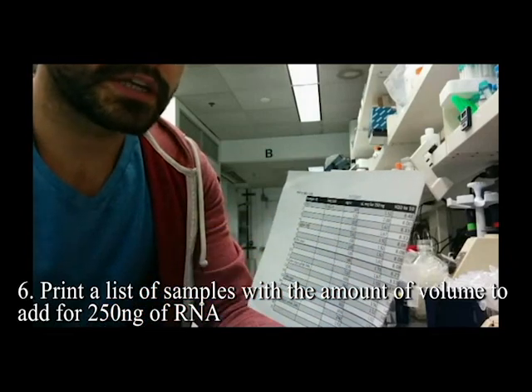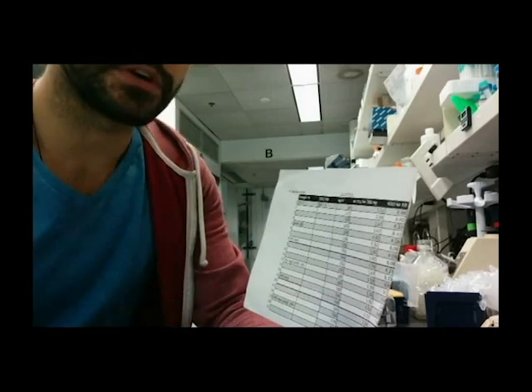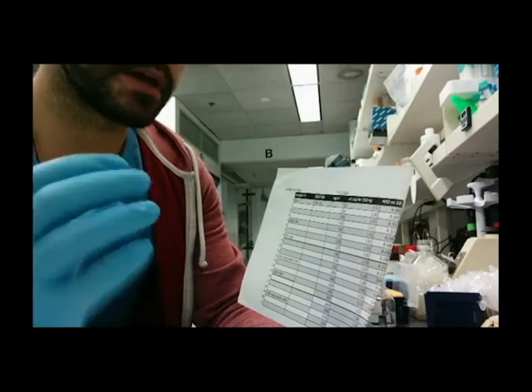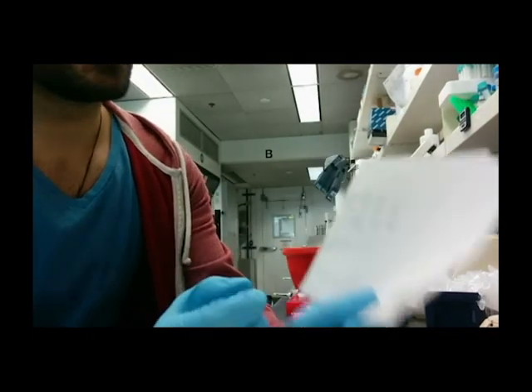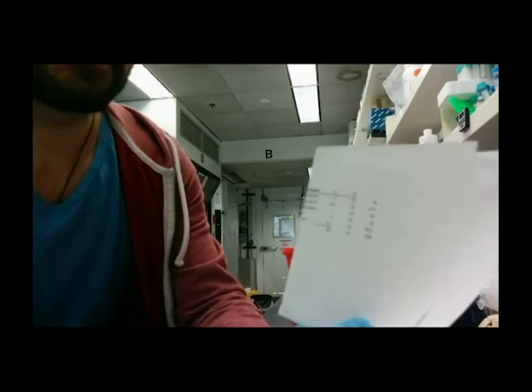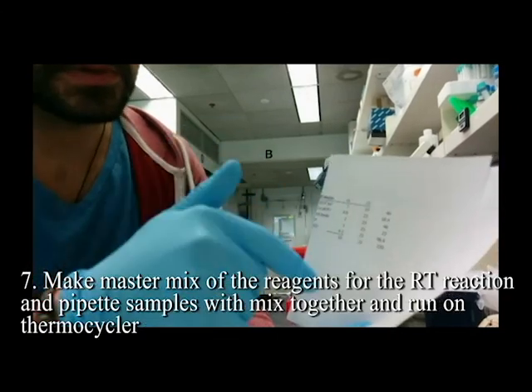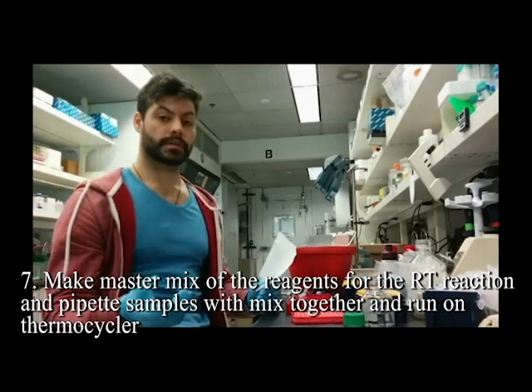The next column shows the amount of water needed per sample, because this is a 2x kit — the master mix is twice as concentrated as needed, so I double the volume to get the right final concentration. That brings the total to 10 microliters per sample, so I add 10 microliters of master mix to each. The master mix components — RT buffer, dNTPs, random primers, and RT enzyme — are listed on the Applied Biosystems website. I multiply each by the number of samples and pipette everything into one single mix.